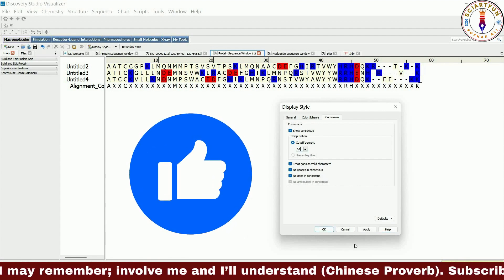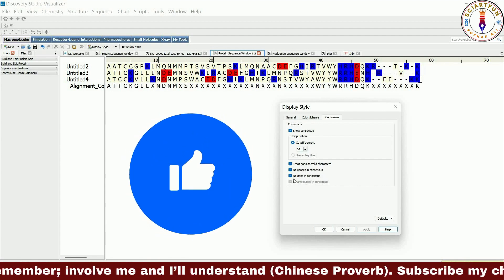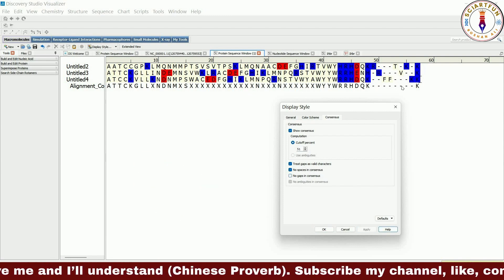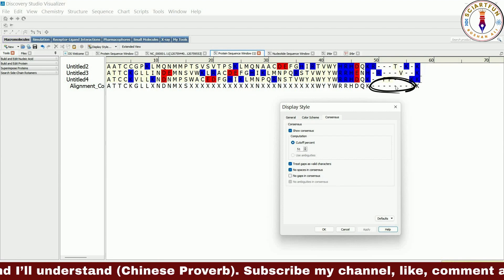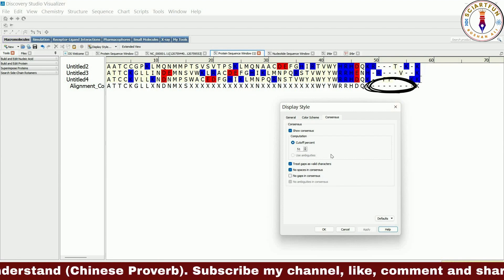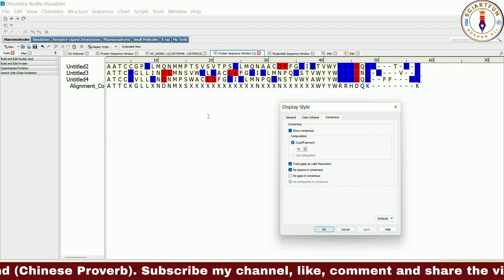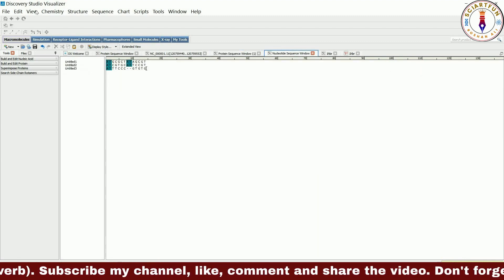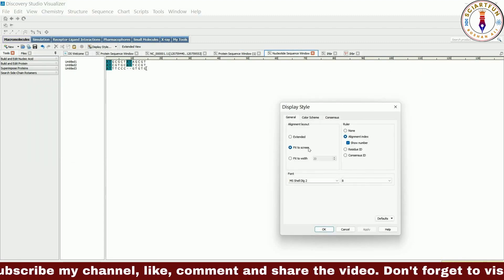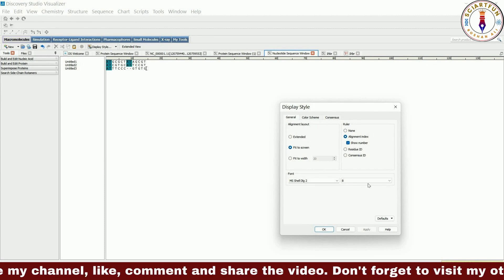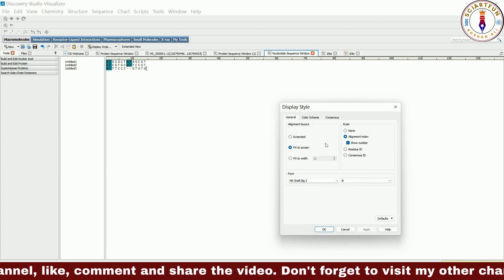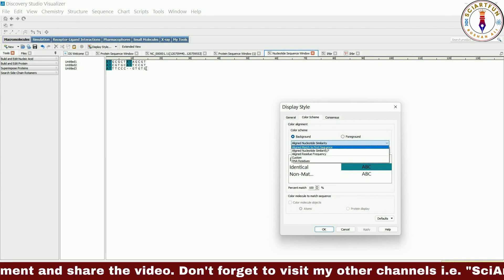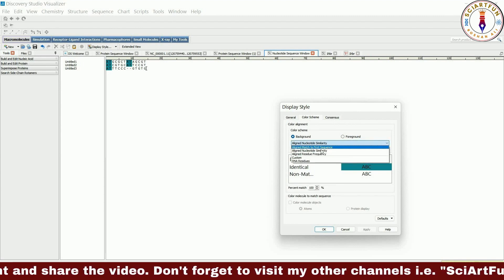If you consider gaps as valid characters and uncheck no gaps, this will remove the X entries from the consensus. Now let's go to the DNA sequence and open the dialog box. This will have specific options in the color scheme tab. Let's try these options.